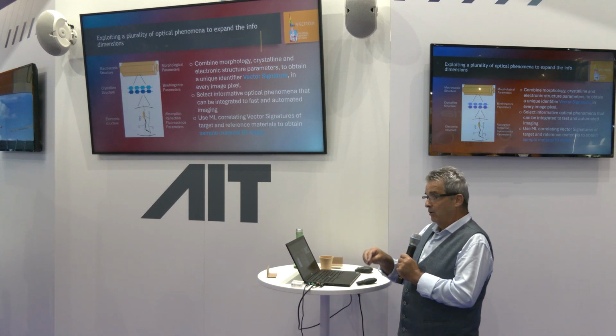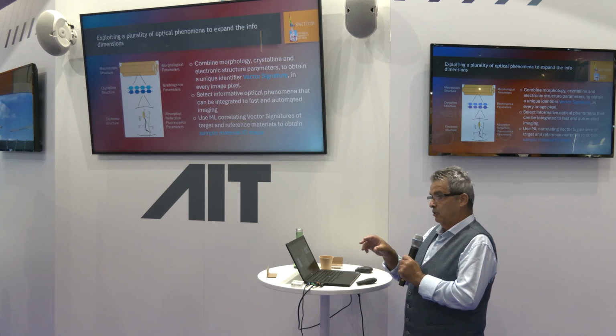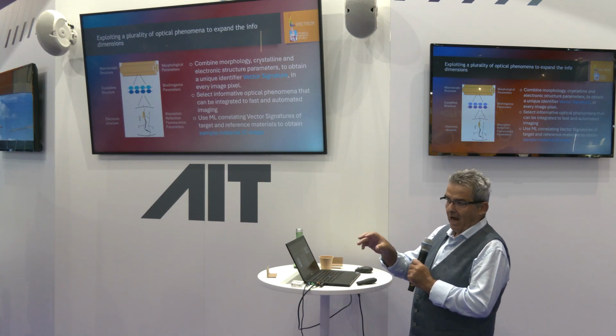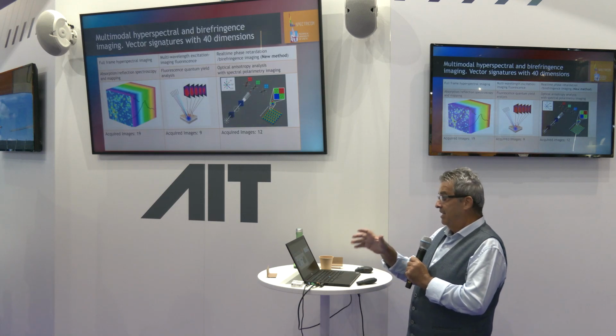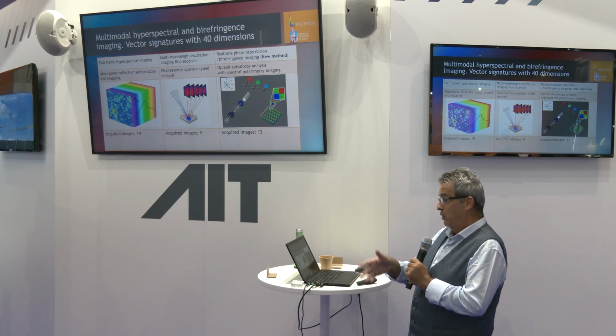Second, we want to identify the spectral characteristics of the materials, which are related to the electronic structure and other structures of the specimen. So the multisensorial aspect of our system is that it can do snapshot real-time hyperspectral imaging with the devices that we have developed.